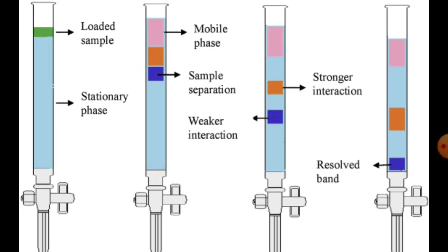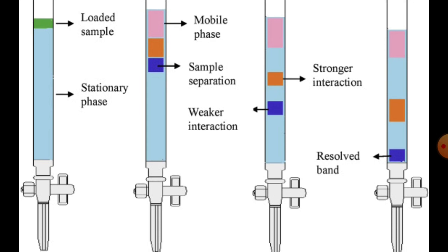So what are the applications of column chromatography? Column chromatography will help you to separate or purify important components from the non-important components. Then it helps you to purify important metabolites from a particular mixture, and it will help you to determine phytomenadione in drugs and injections, okay. So that is the concept of column chromatography.